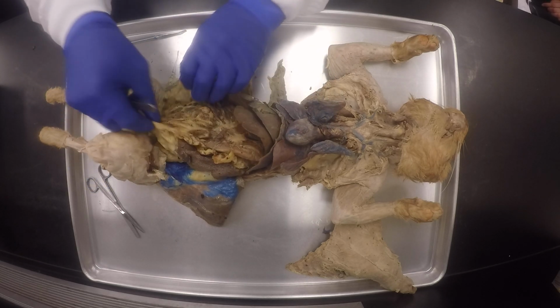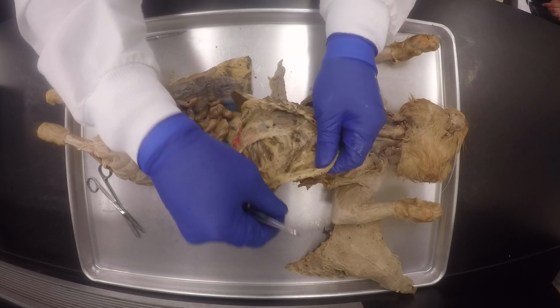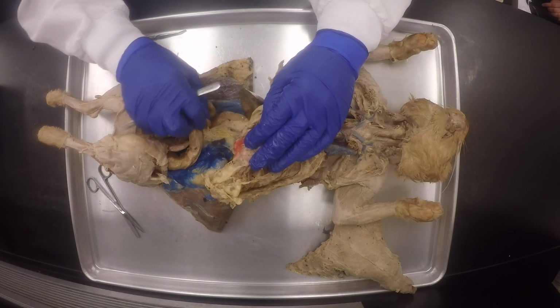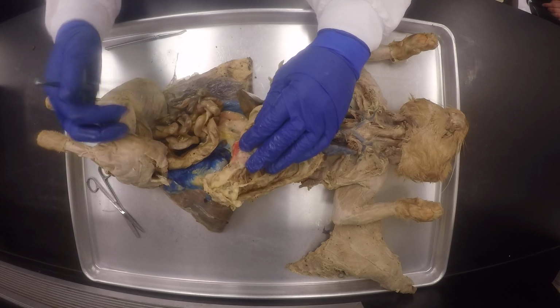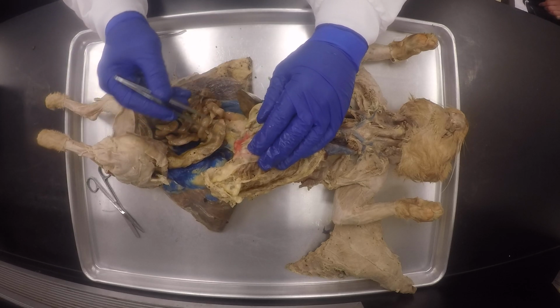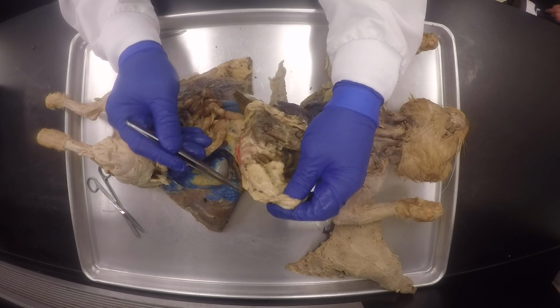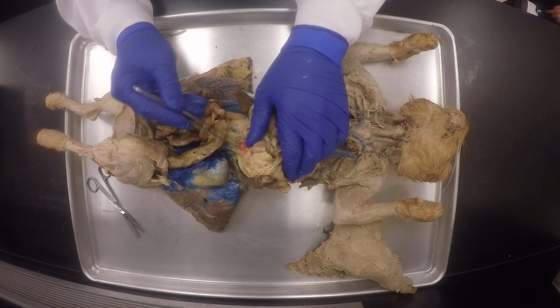Okay, my good friends. And then we open the apron like this. Oh my God, they really infused this. The apron, which is the greater omentum, by the way. So, and the other organ I'm going to ask about would be this. So the question would be like, what's that organ? You see, that goes from here, all this pancreas.